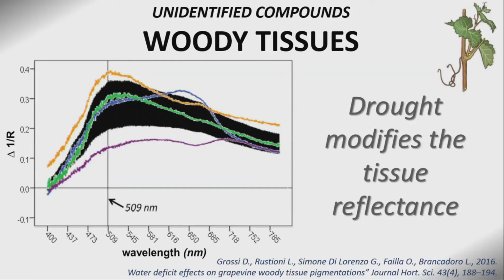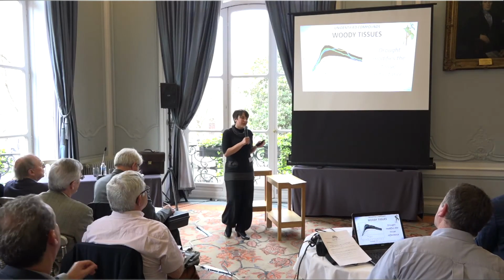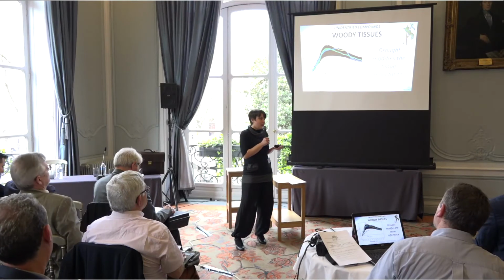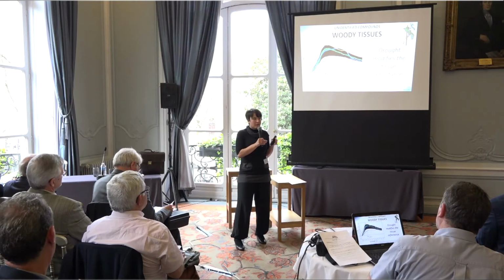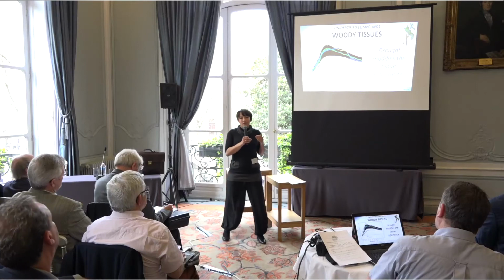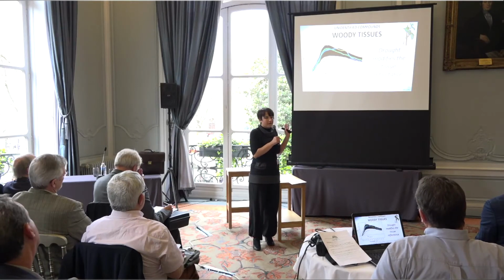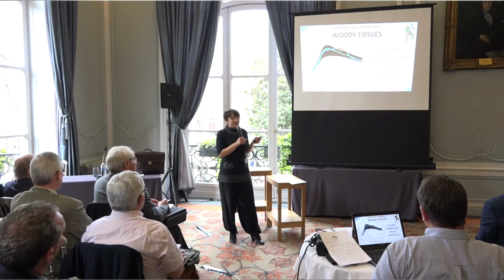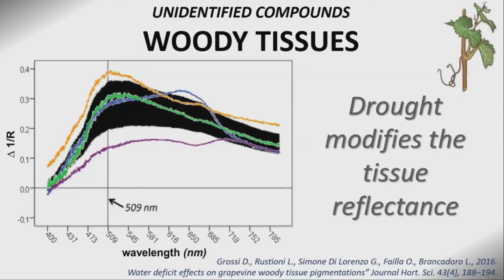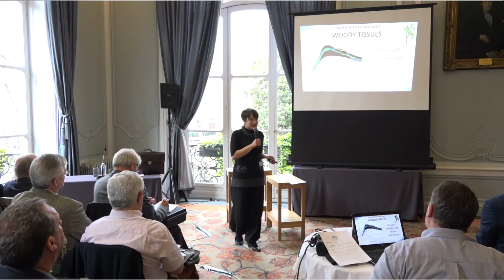However, we have a lot of historical knowledge from microscopy, concerning stainings, which can color specific classes of compounds or specific compounds. So the idea was to produce on-solid reactions and to quantify the compounds by a fast approach. One of those analyses requires a couple of seconds, and the coloration, the two that I will show you, require 3 to 5 minutes, and you can manage many samples at the same time, so it's much faster than microscopy analysis.